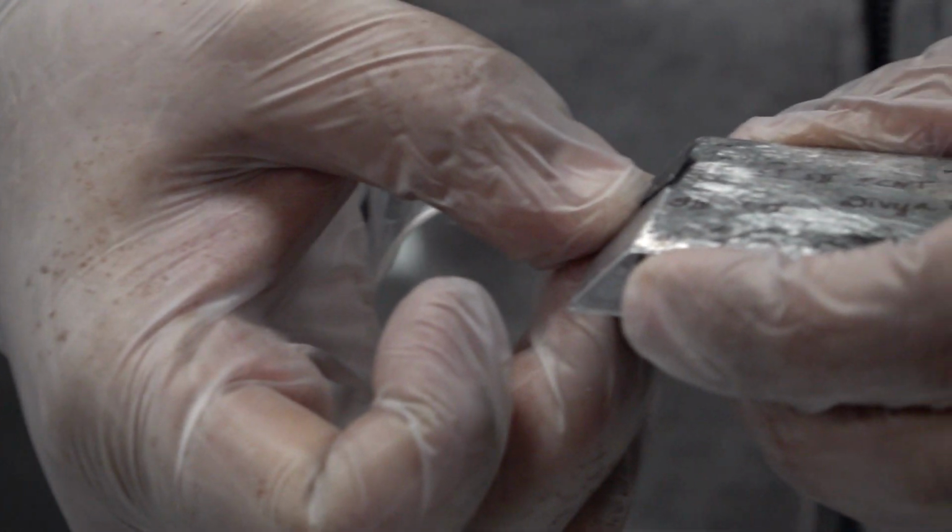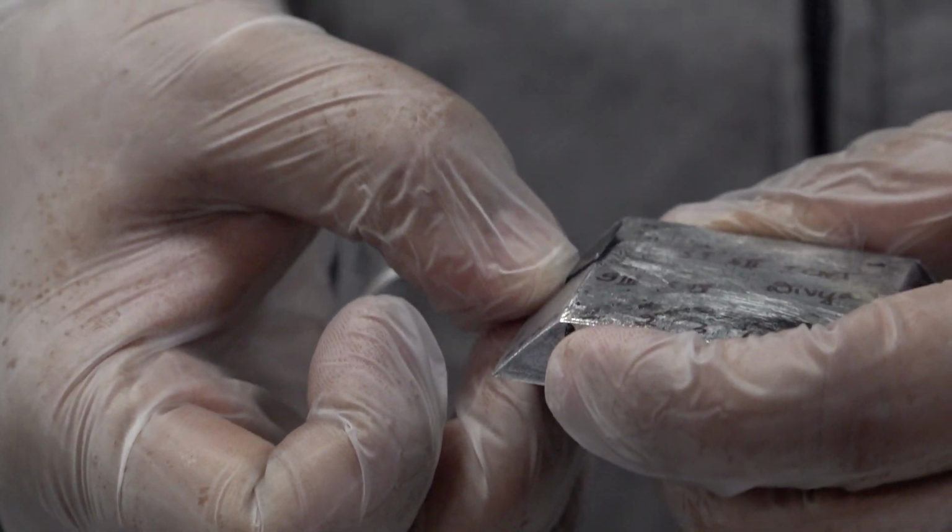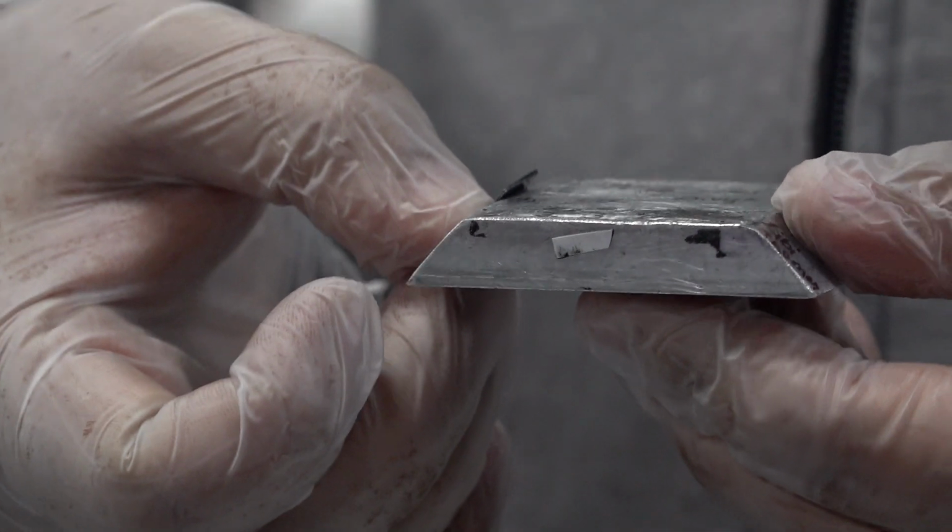Many a times you have a feature which you need to be inclined at 45 degree or something. In that case, you can mount your sample like this at 45 degree and you can observe the feature. So in one stub, you can mount the sample in 3 ways according to your need of information.